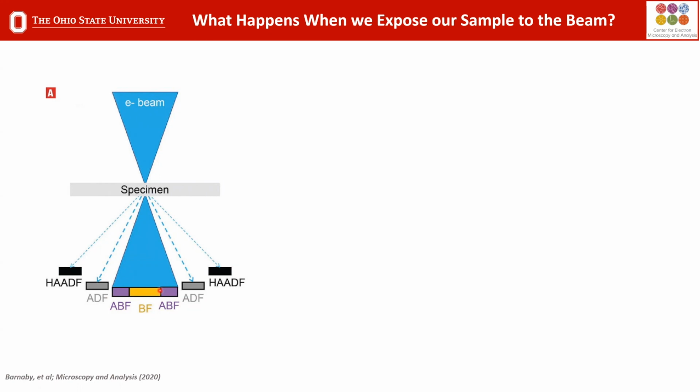So when you're a microscopist and you have a sample in the microscope, what you try to do is optimize your specimen. You then try to decide what information it is you want to look for. You then optimize these angular ranges and conditions so that you have a detector in the right field of view or the right orientation to collect the signal you want. And that's been a very tedious and time-consuming process for all the time when doing microscopy. We'll talk about how these new detectors can relieve some of that stress.